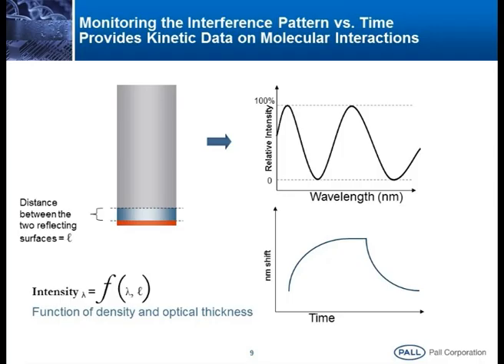What is the on rate? The on rate is nothing but the association rate. The off rate is nothing but the dissociation rate. So, dissociation rate divided by association rate gives the affinity. So, we have to determine these affinity constants. If proteins are interacting strongly, this affinity is in the picomolar range. If there is a moderate interaction, say when an antigen binds to an antibody or a protein binds to a receptor, you will see the association phase.